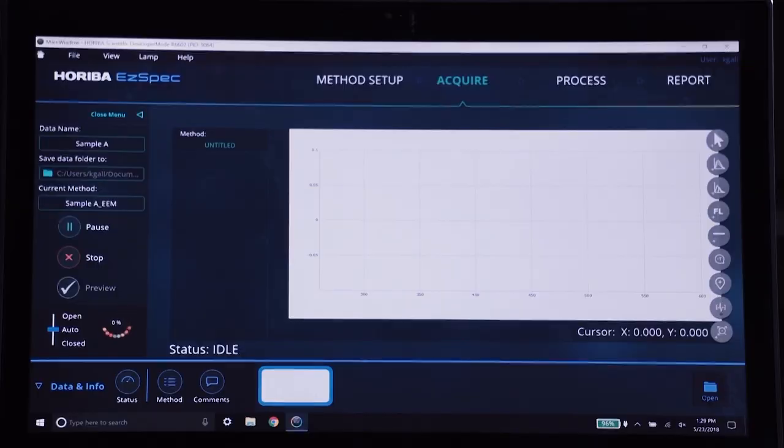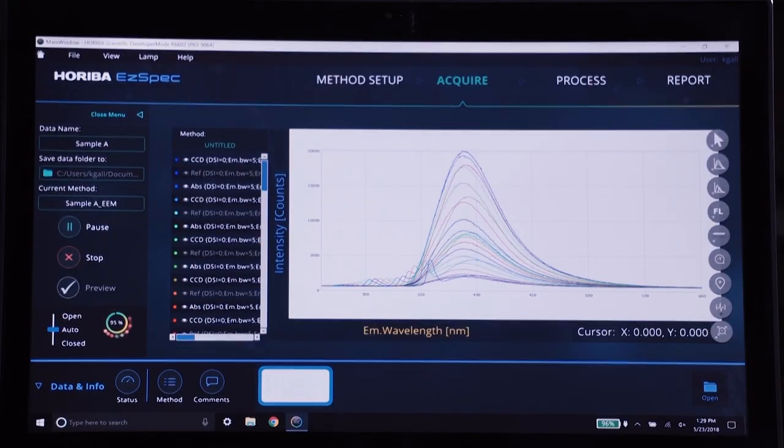So with Duetta, we're really taking fluorescence to the next step, which is to go all in with a very well done CCD based platform that has all the benefits that come with that. We can collect that entire emission spectrum in the blink of an eye. So rather than waiting a few minutes for an entire spectrum, we get it much quicker.